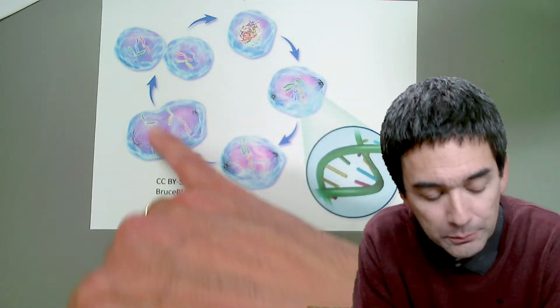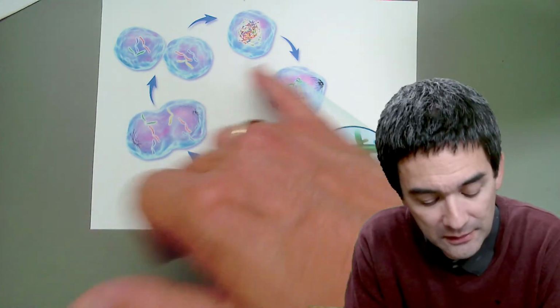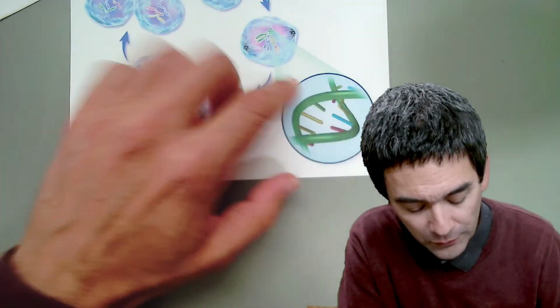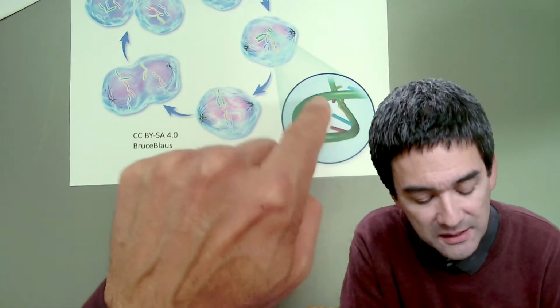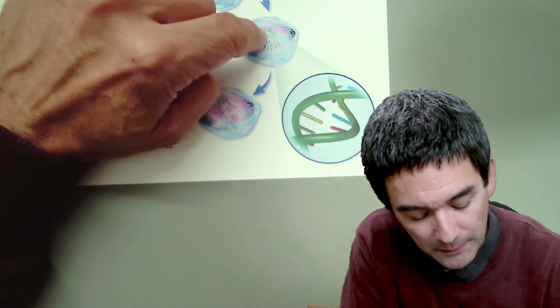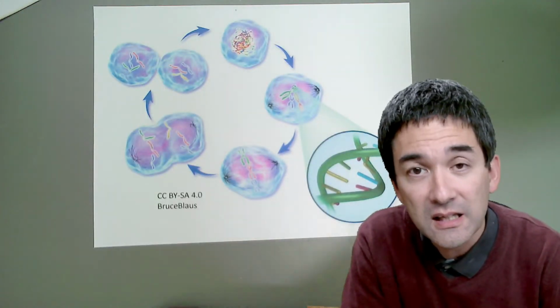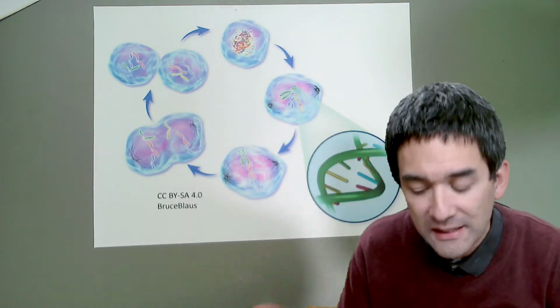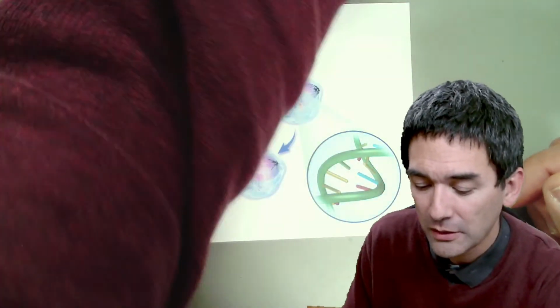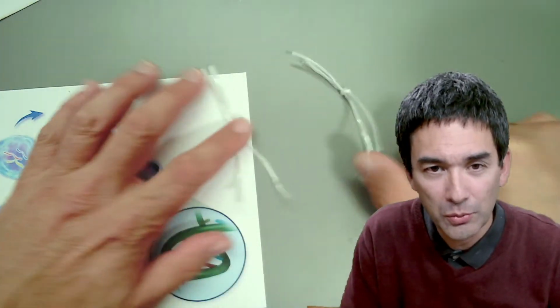And this is what the process of mitosis is all about, and what I would like to explain to you, and where we can actually also see it under the microscope. So what we have here, for example, is supposed to be DNA. And what you see in here, and that's a little bit difficult now, these are chromosomes. And these chromosomes are DNA, very compact and very dense DNA. What I've done here is prepared some strings. These are supposed to represent my chromosomes.